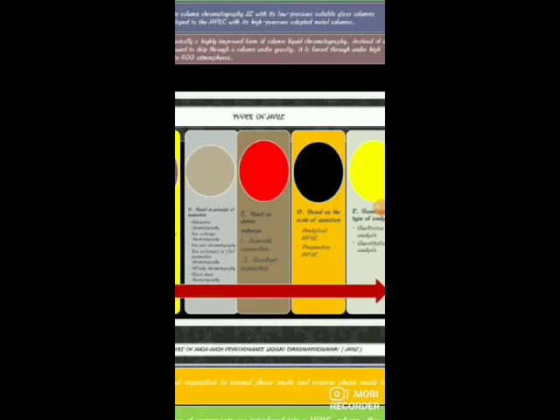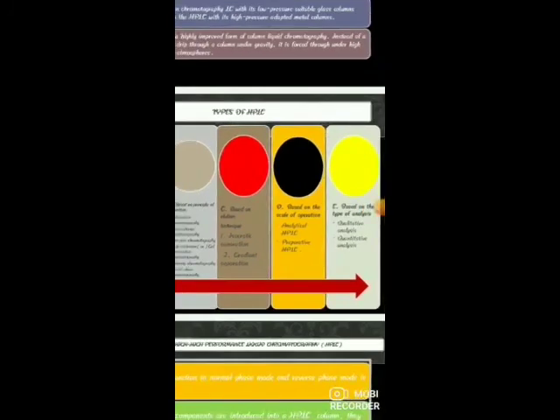For example, analysis of a sample where a very small quantity can be determined. So analytical HPLC we use for analysis of a sample, when the quantity of the compound is very small. And in preparative HPLC, for example, individual fractions of a sample are analyzed, and more quantity of sample is required in this preparative HPLC.